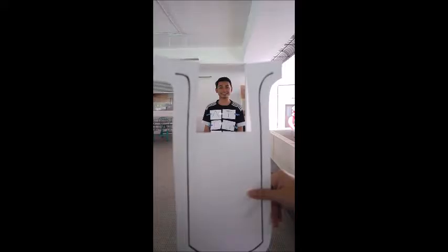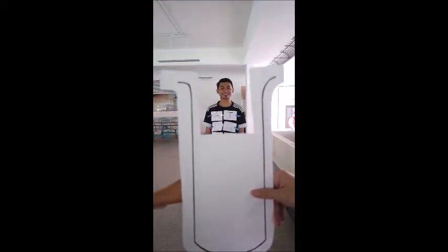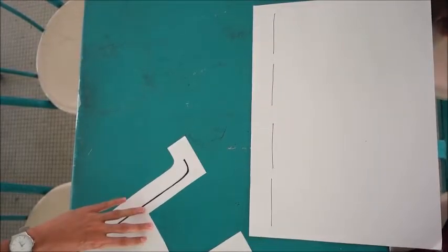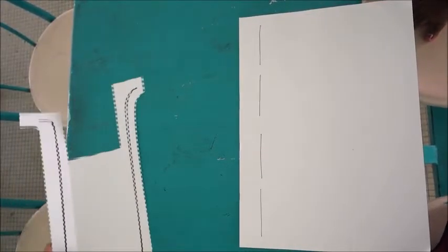And last one, the bases of ddNTP is also added. DNA polymerase is now attached to primer and consequently seals all the bases together. Now, the mixture of first test tube is added to the first column, second test tube added to the second column, and so on in the gel electrophoresis.